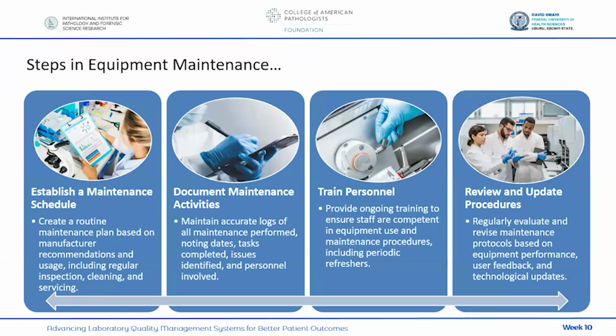It should be documented. And before anybody starts using any equipment, that person must be trained. You should know how to handle the equipment. You don't just jump into a laboratory and say, okay, even if you have used that equipment, maybe wherever you're coming from, immediately you enter a new establishment.